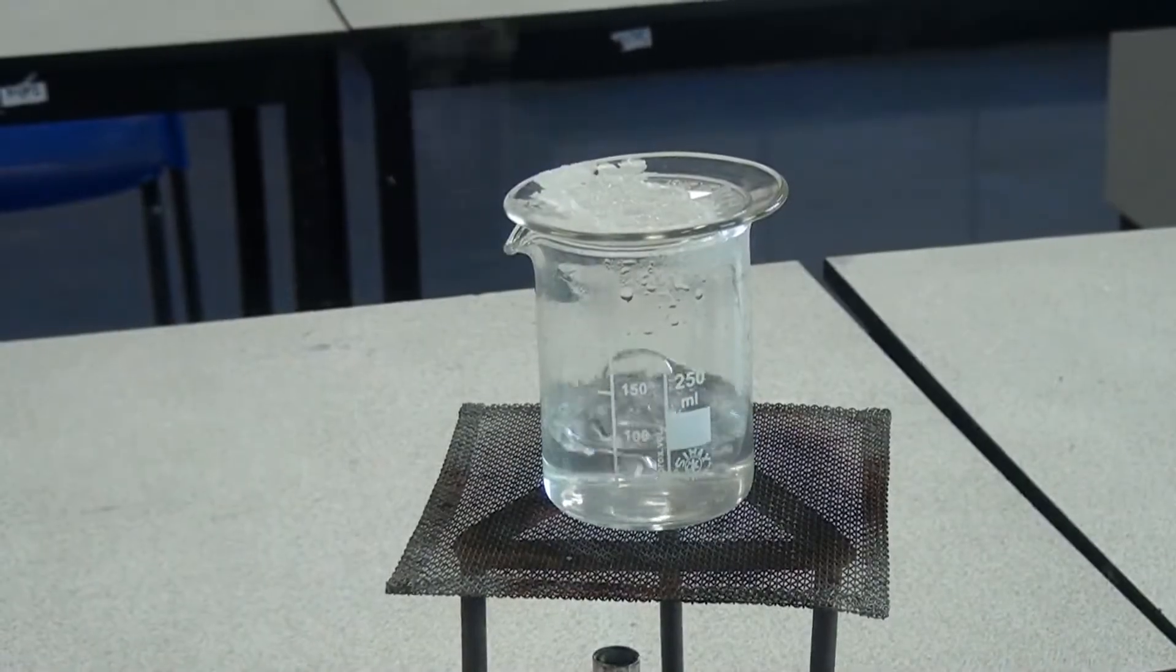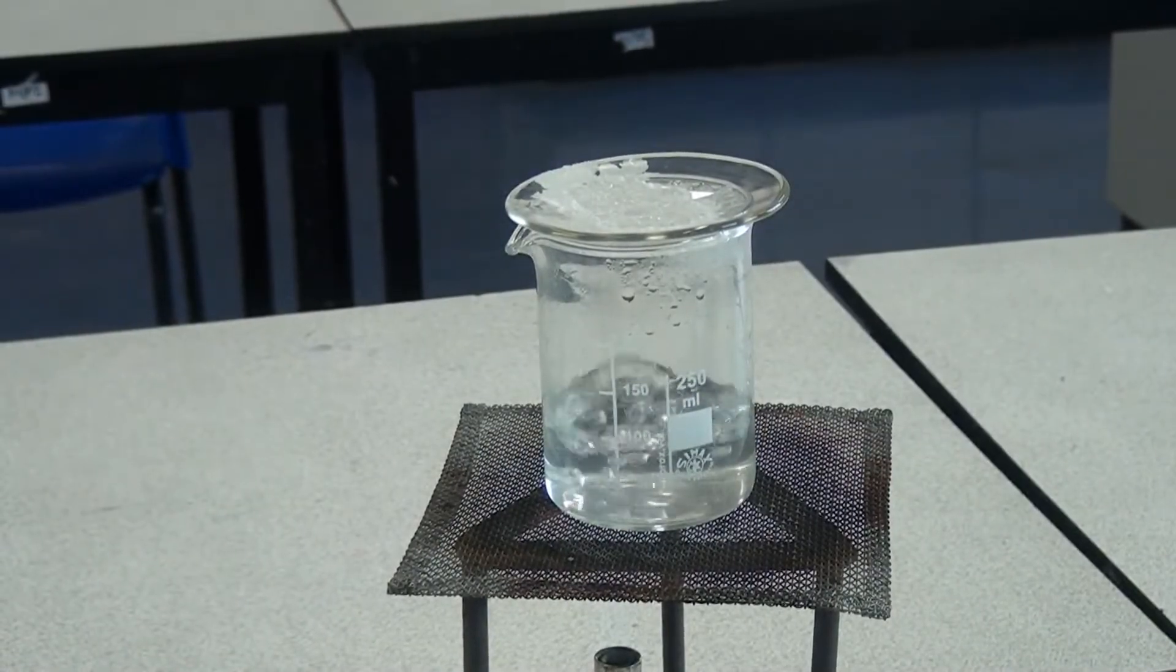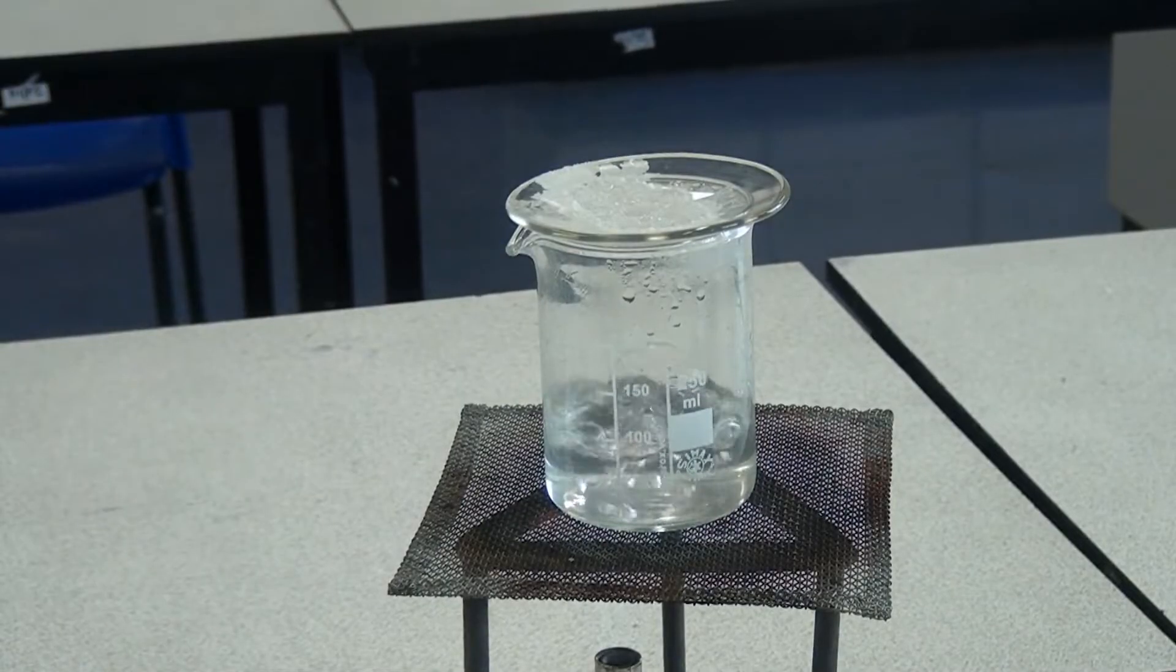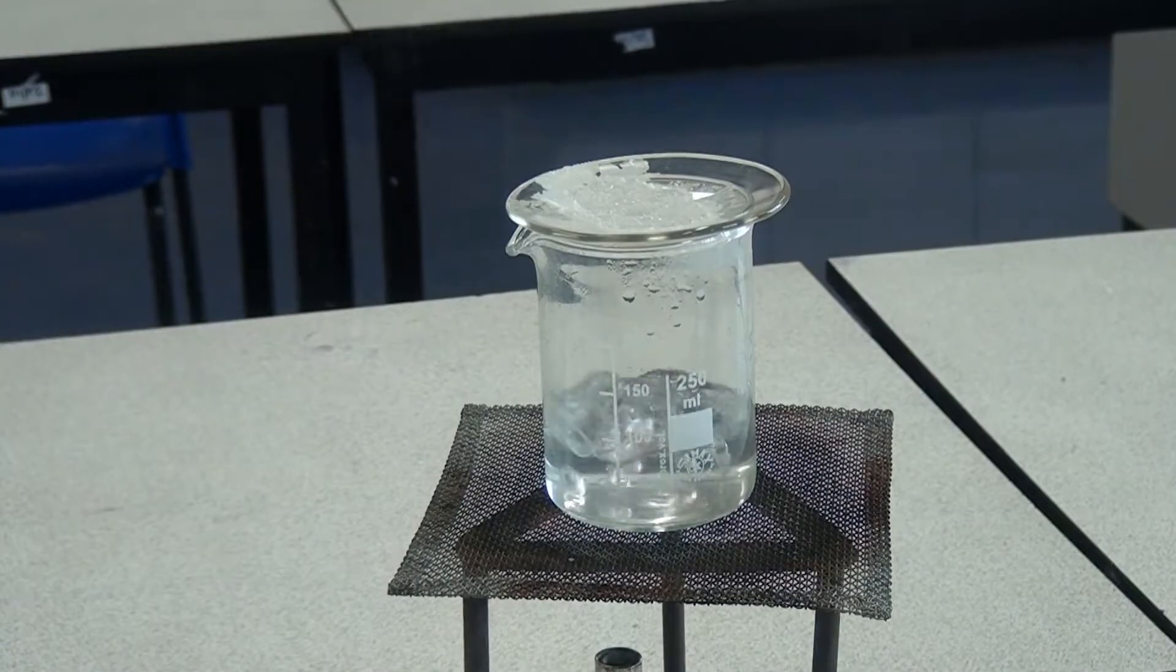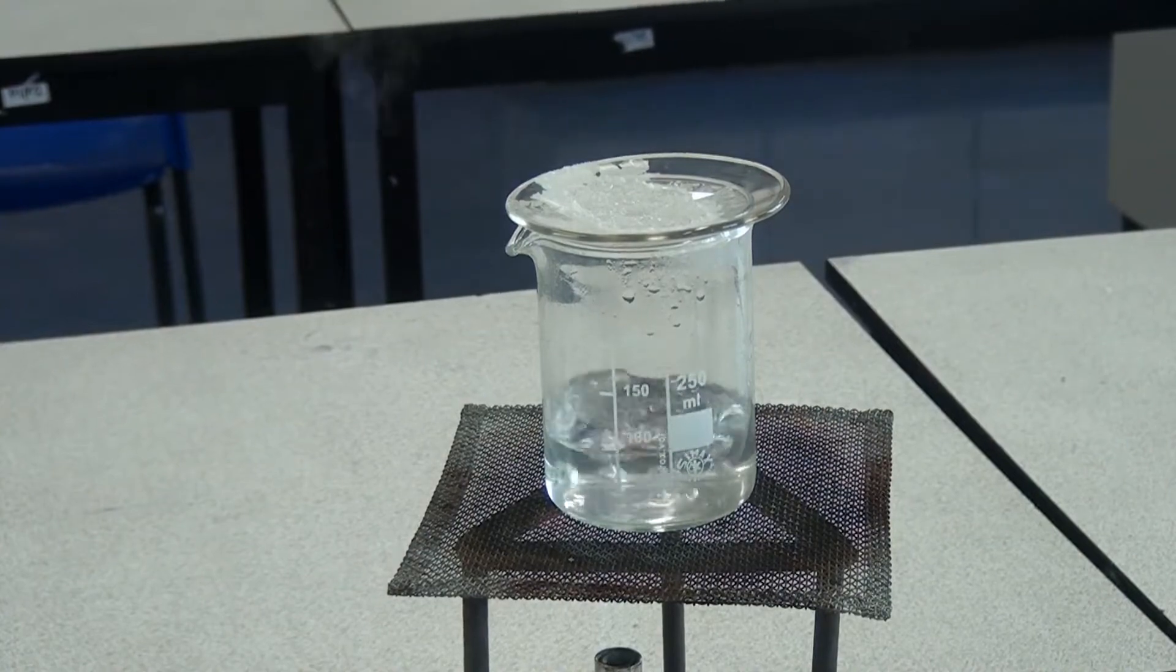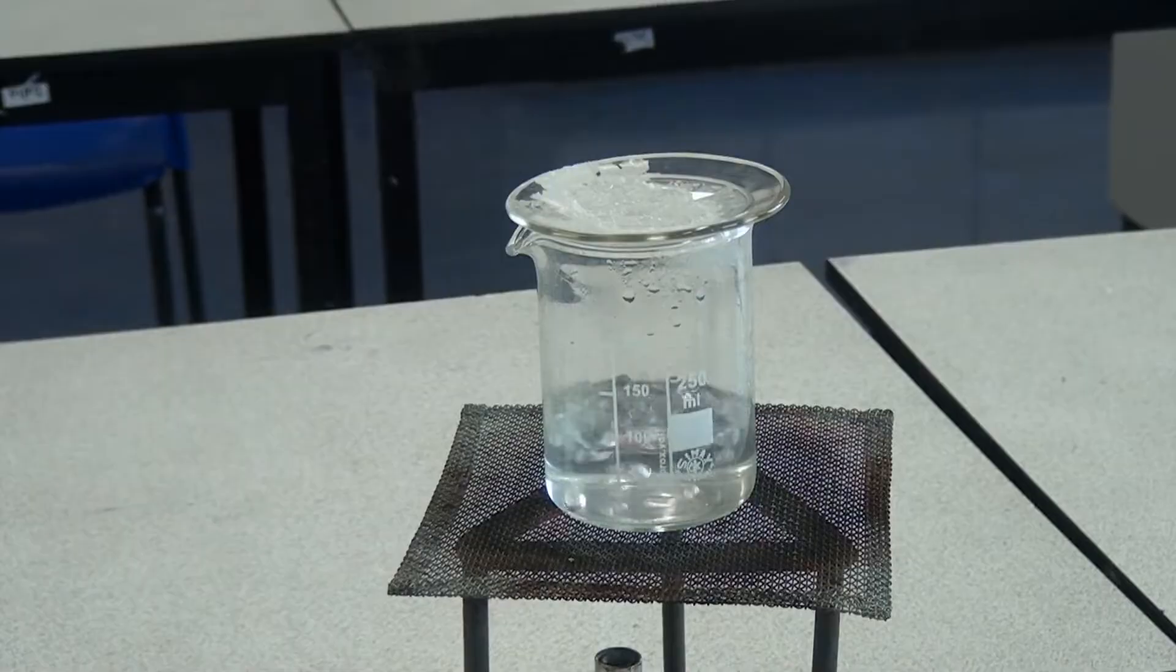We can see now that the water has evaporated from the sample of seawater and it's left behind any dissolved salts on the watch glass. So I'm going to turn the Bunsen burner off, let it cool down, and then we're going to work out how much of those dissolved salts were in that sample of water.